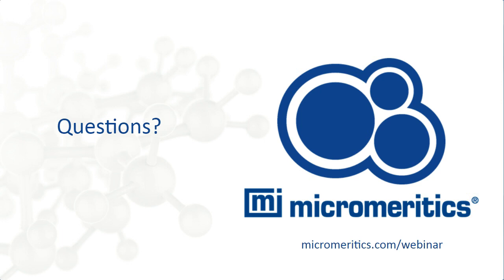And I'll just add to that what you said, Nikki, is an example we gave today. The three materials that tested looked exactly the same by the normal quality control procedures, and so until they looked at the FT4, they weren't able to see differences. And now they can actually have a specification that can then help them determine what raw materials will give them high yield performance in their electrode manufacturing. Yeah, exactly.